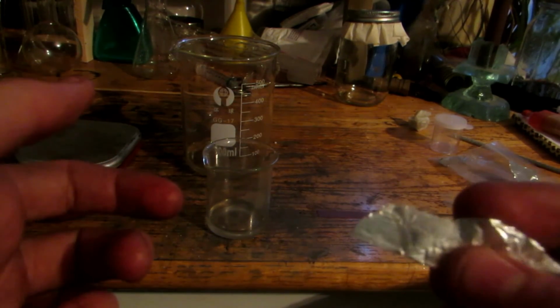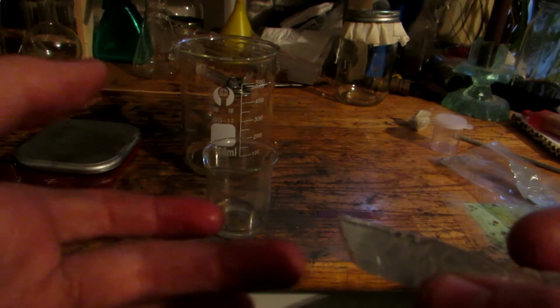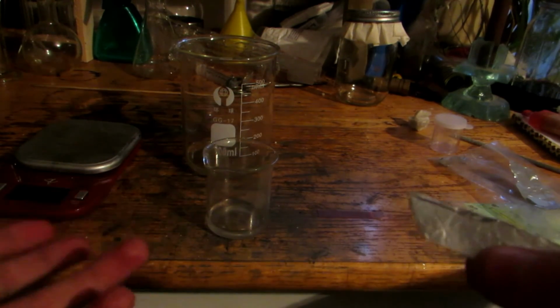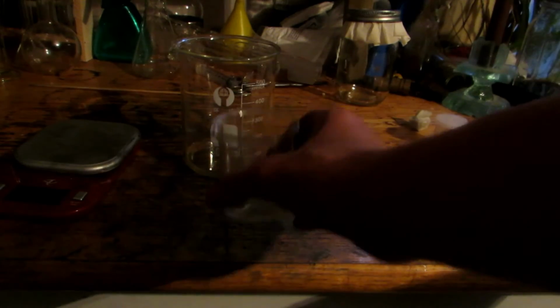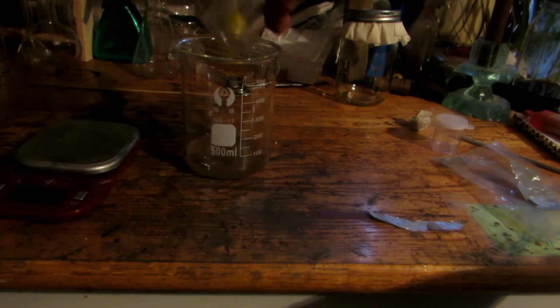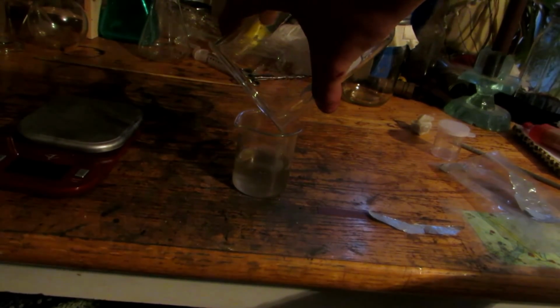But so that's on that side, and then over here we have the aluminum foil that was untouched, and the same thing appears on the other side. So this very clearly worked at dissolving this aluminum foil, which means we definitely made some potassium hydroxide, or else this would not be possible. So this shouldn't be too impure, and we are going to purify it, so I'll just add it back to our other beaker, and actually I'll put it in the smaller beaker, and we're just going to go ahead and boil this down.